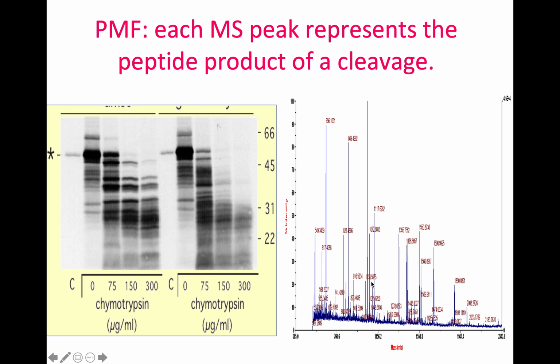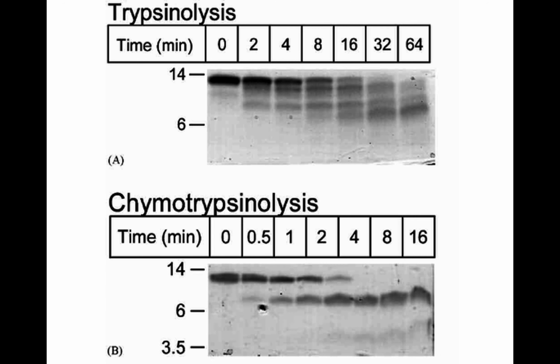So from the MS you will get the result in peaks, and of course this will be decoded or analyzed further by software that will tell you which amino acid each peak corresponds to. So it depends on the type of experiment that you want to do. One of them is that one peak corresponds to one amino acid. Another one is that one peak corresponds to one peptide or one protein. So there are two ways of analyzing it, which we will see.